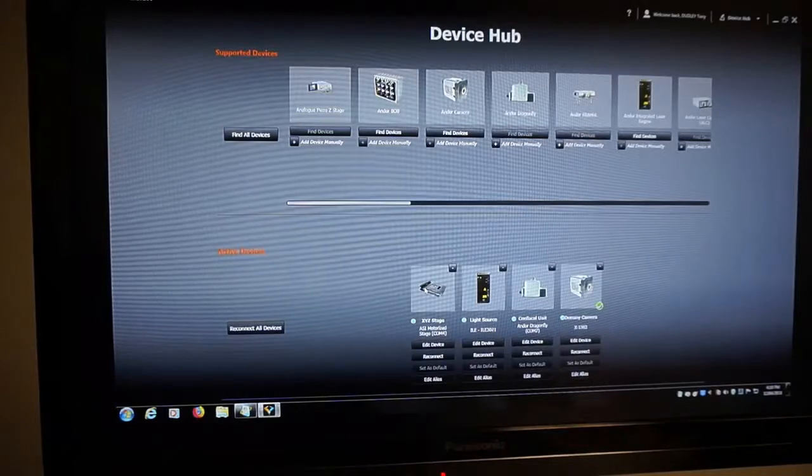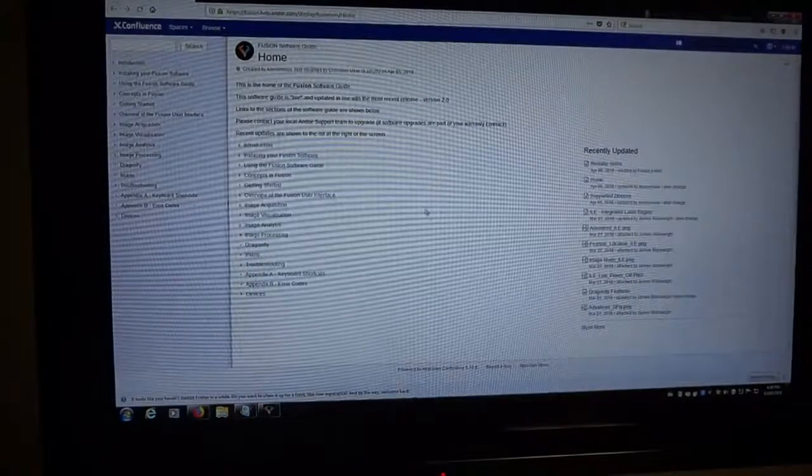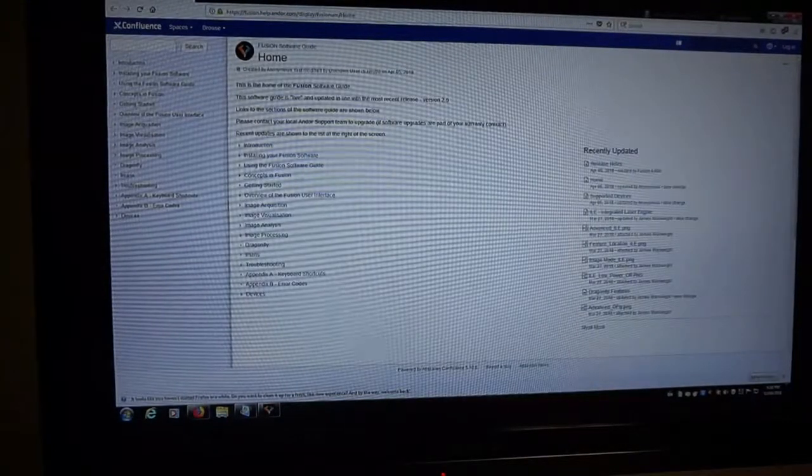Okay, so here for fun, I've got a stage connected, an ILE, a dragonfly, and a dummy camera. So this won't give us any real images. I've got your username up here. There's a link to Fusion Help, which if you click this should open the website. Let's see if that works. Okay, it's trying to open Firefox. And here's the public Fusion manual, I guess. Okay, so that's there.